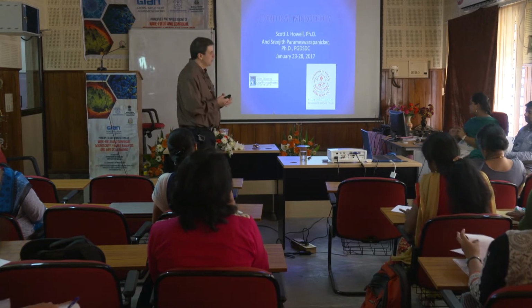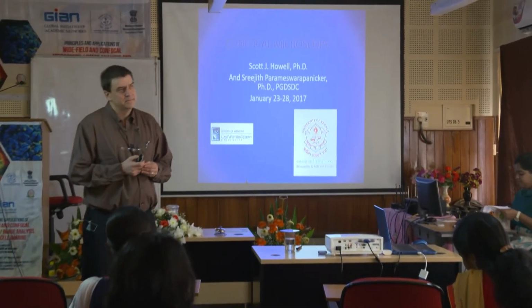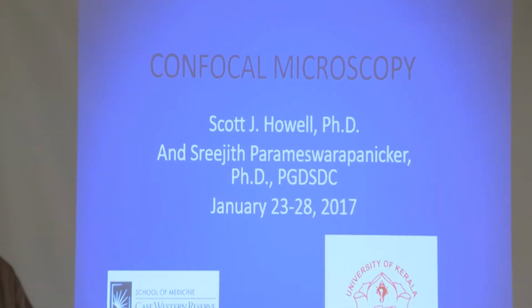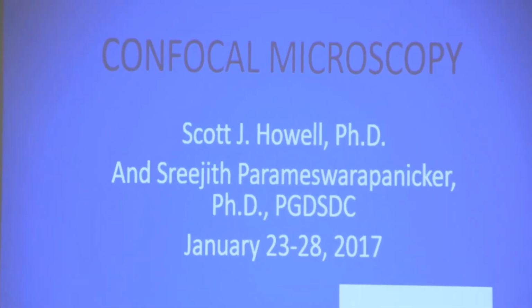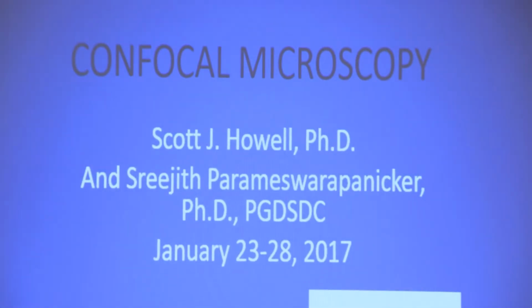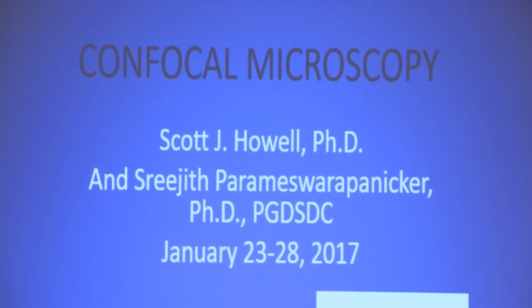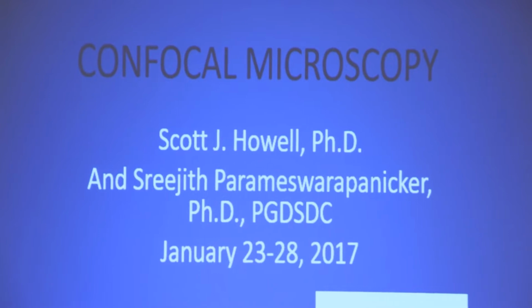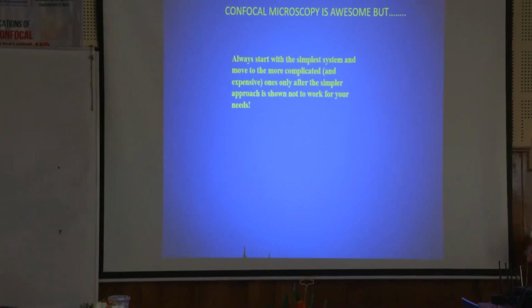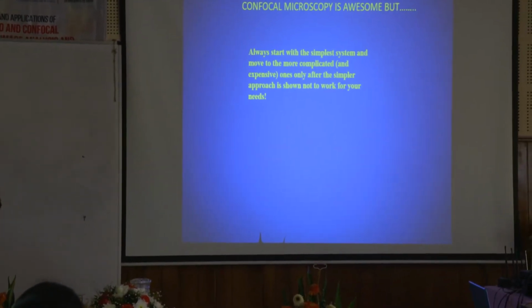Okay, so the confocal microscope, which is the instrument you have here. You see them in a lot of places. They've been around since about maybe 1989, 1990. I never really got to work on one until probably the mid-2000s or so. They're definitely becoming more common. You see them more often. It's a pretty standard research instrument. It is an awesome tool. It does a lot of stuff. It's very powerful. It can do many things.